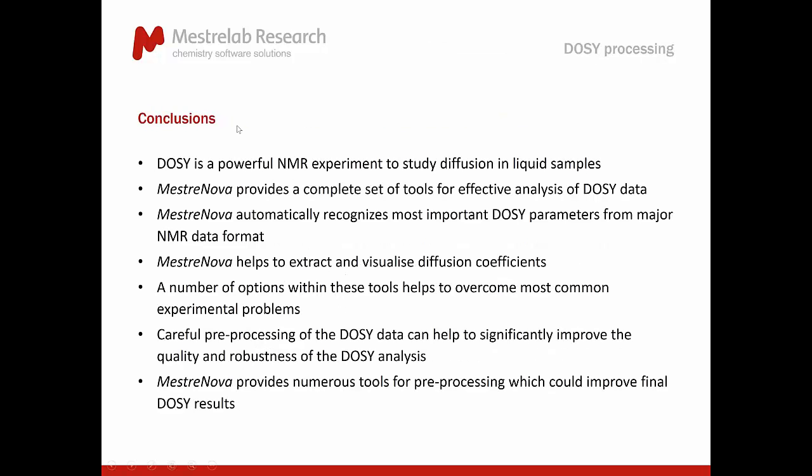And that's basically it. That's my part. That's what I was going to discuss today. Well, the conclusion is on your screens. I believe DOSY is a powerful NMR experiment to study diffusion, and MestReNova provides a good set of tools to do the analysis effectively.